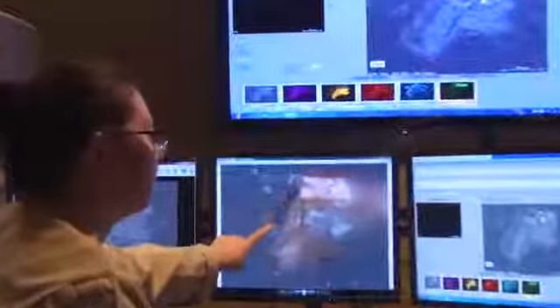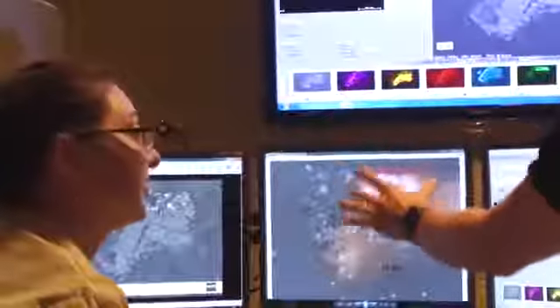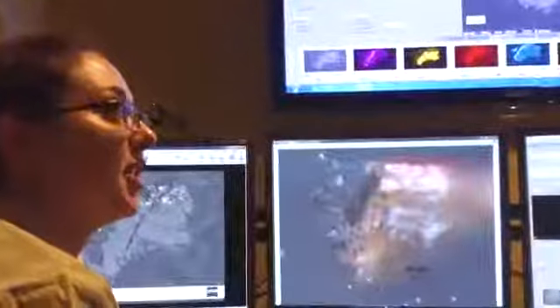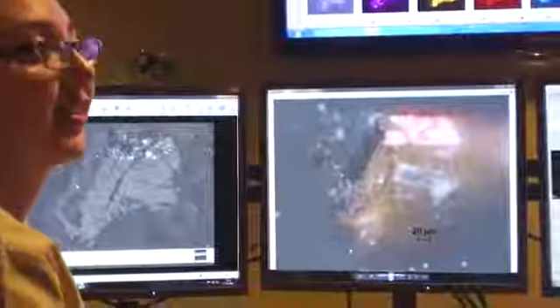And then this is a really interesting cross-section because when I take my hand away, what we're seeing here is one of those deep cracks that we saw under the optical microscope. The real dark area? Yeah, and so you can see that there's two kind of colors that are present, a dark brown-black, and then a lighter brown. This is so hard for me to get, it looks huge, because I'm looking down, but like you said, this thing is just... Yeah, so this scale bar is 20 microns, and that's about a fifth of the width of a human hair.